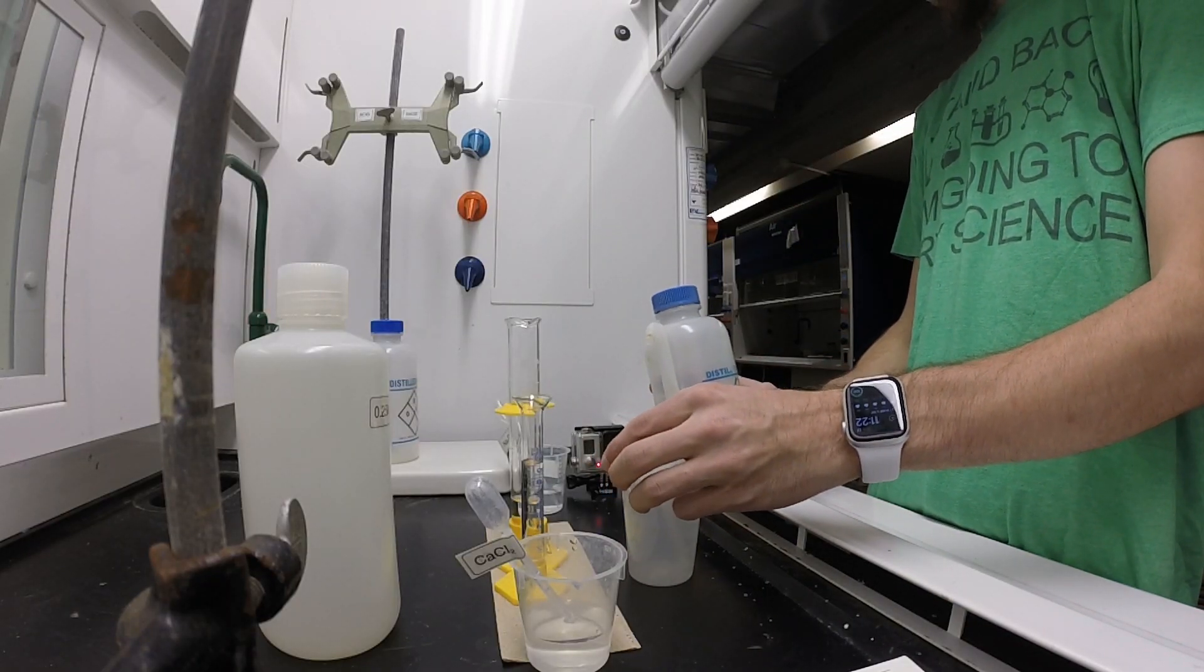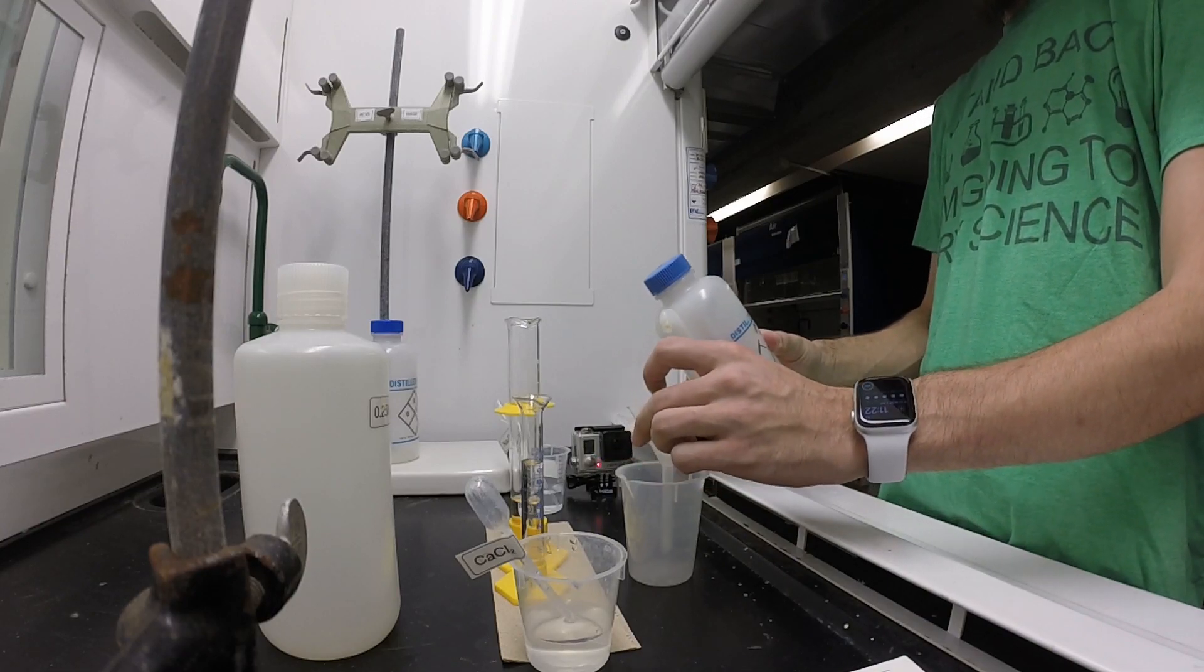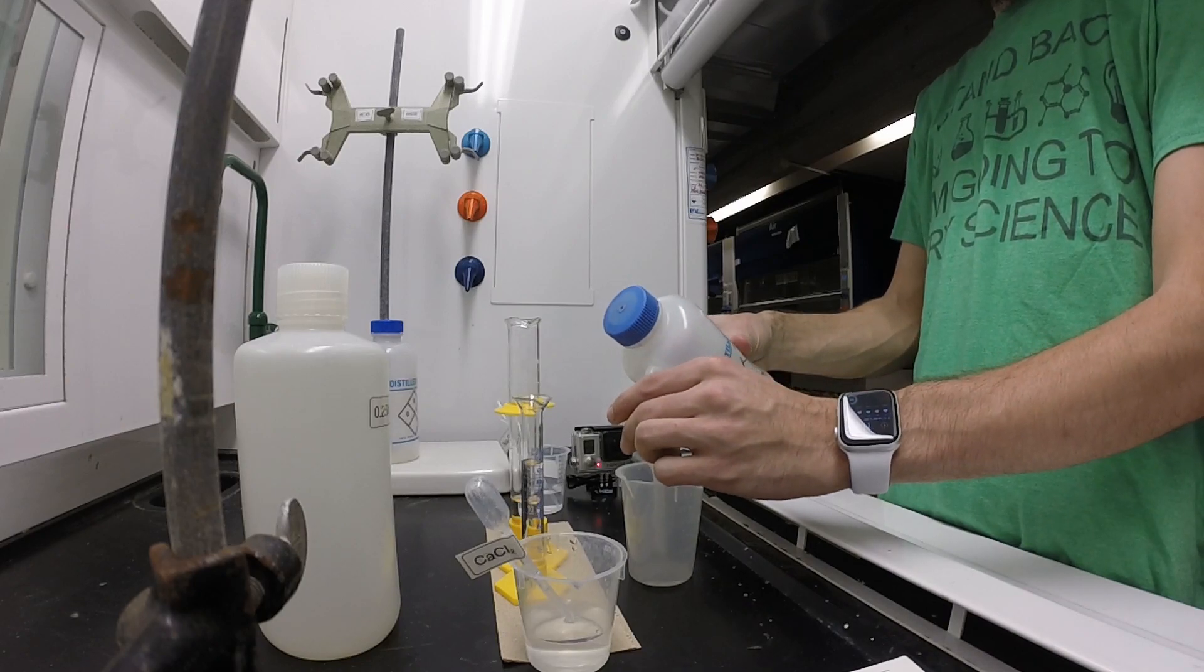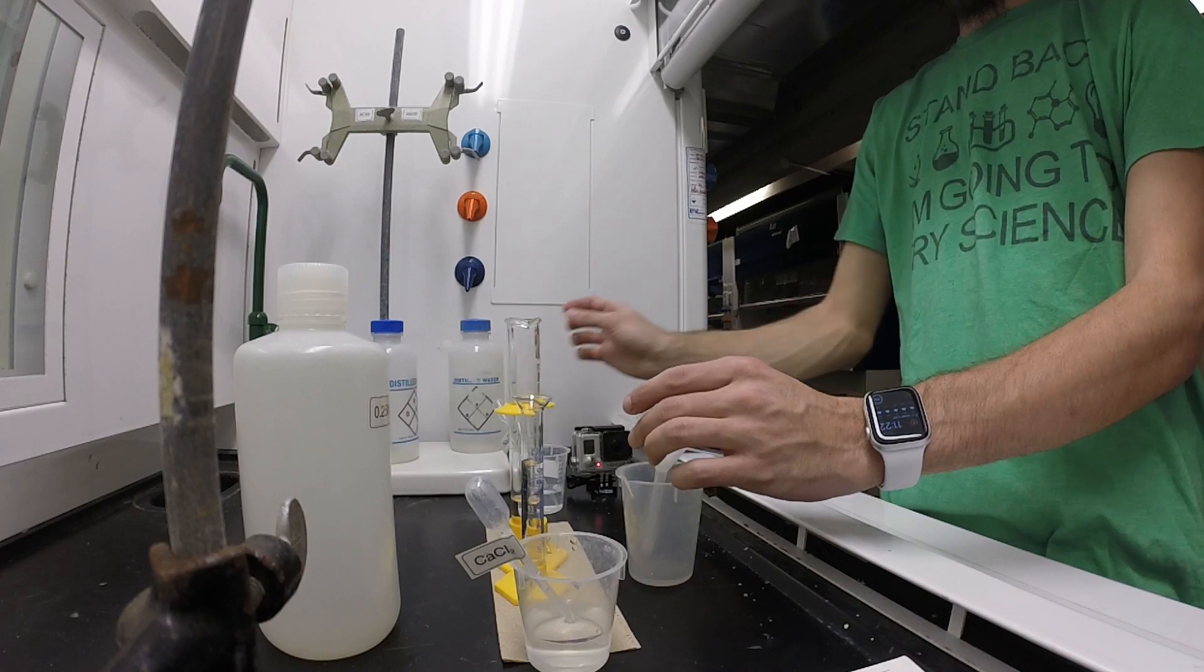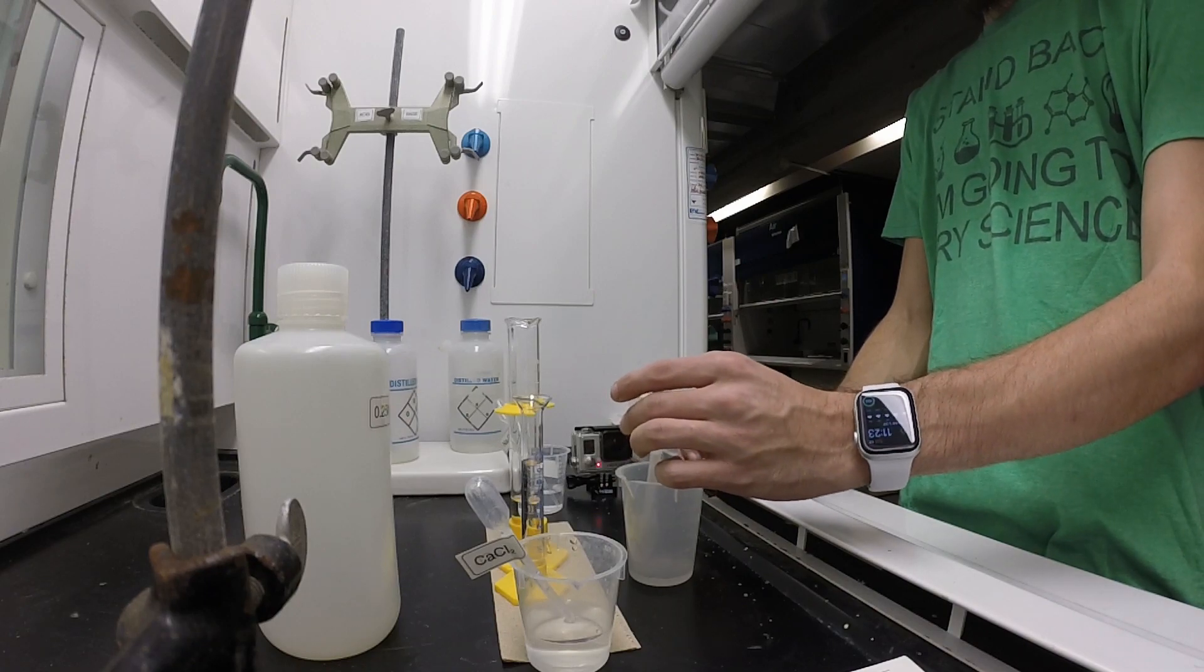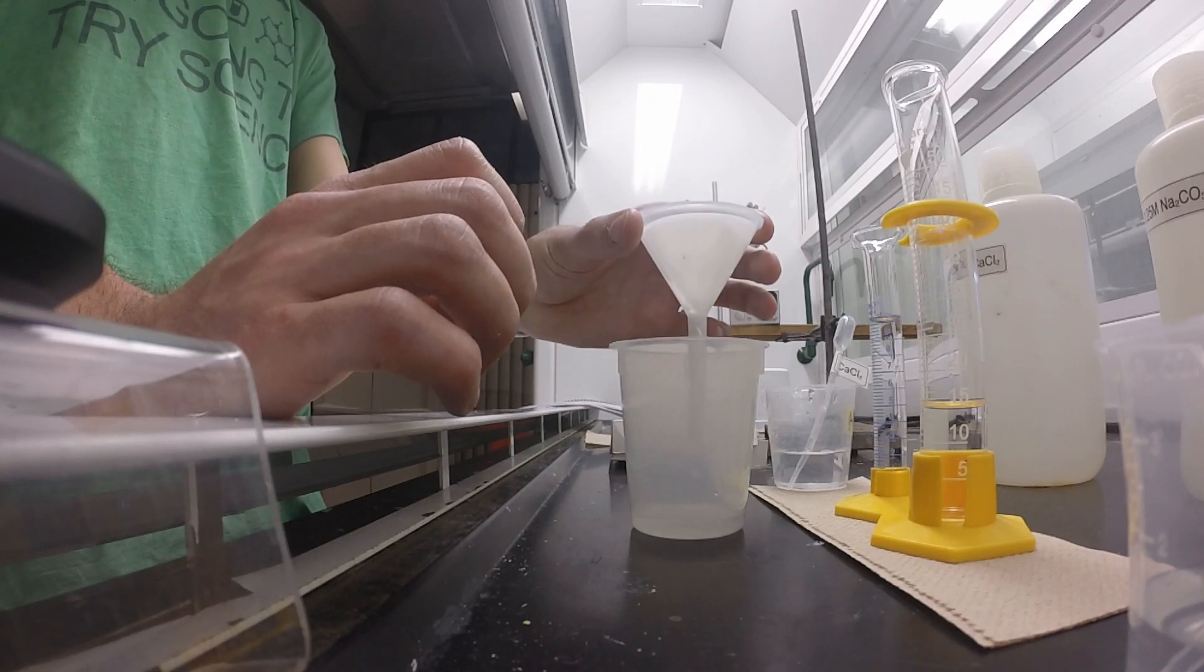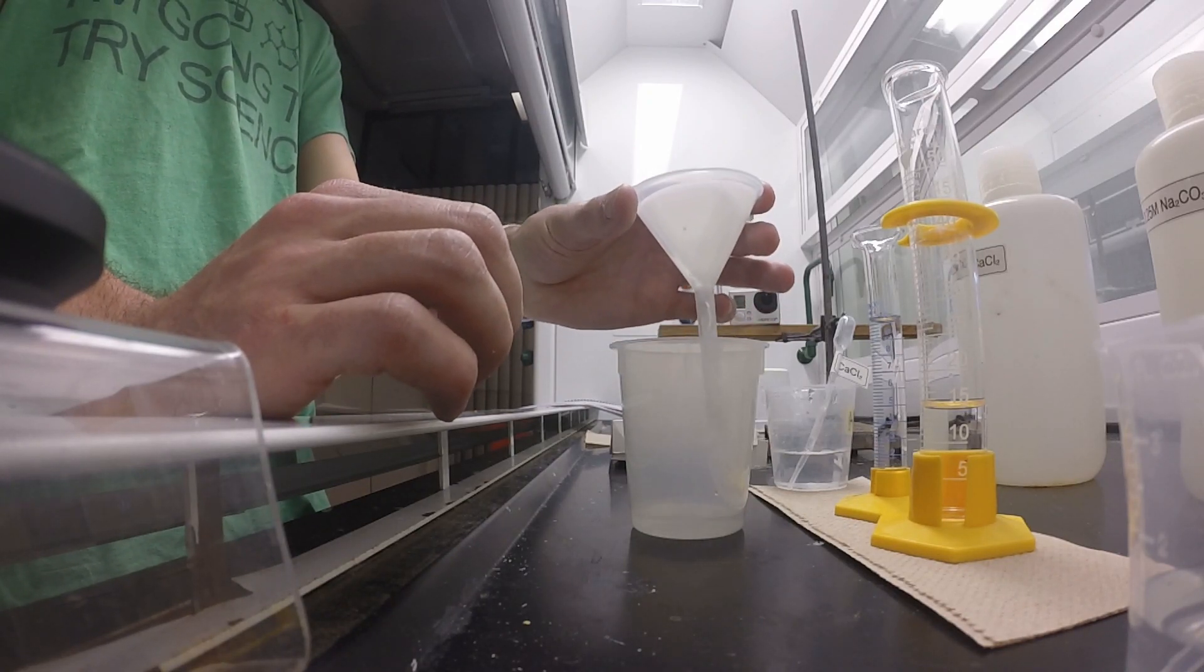Now I'm just going to wet down the filter paper. This is just so it can stick to the funnel - it basically just helps it sit better. This is important too because we don't want there to be much of a gap on the outside of the filter paper, because that would allow our solution to go to the outside and not filter through.